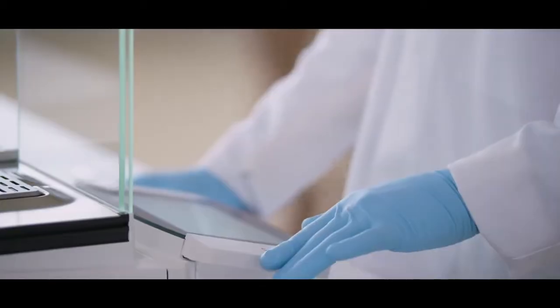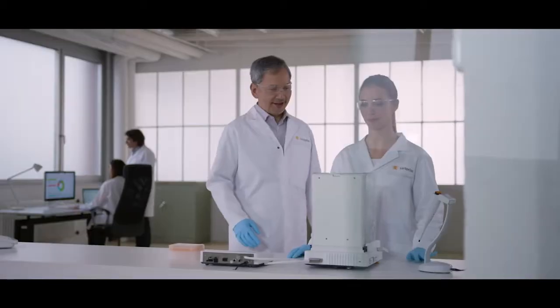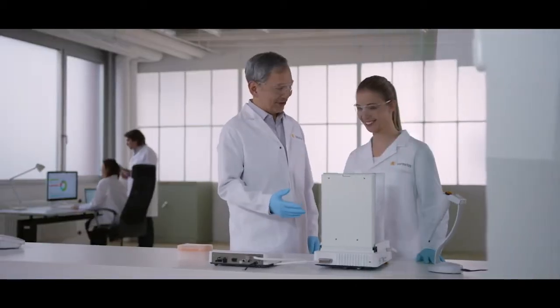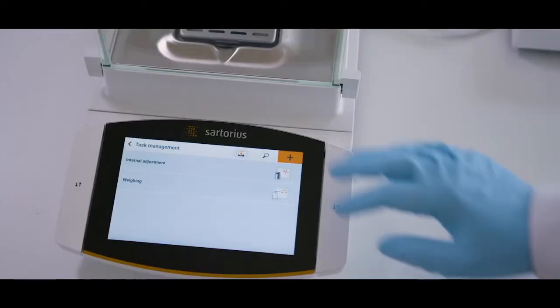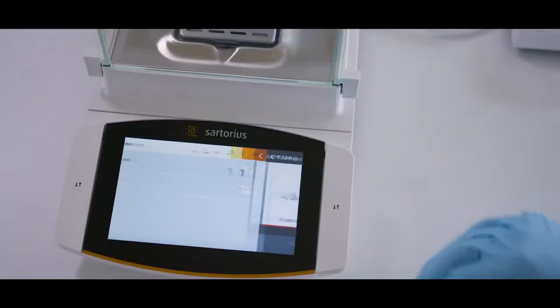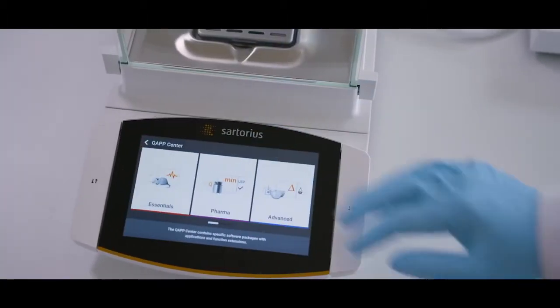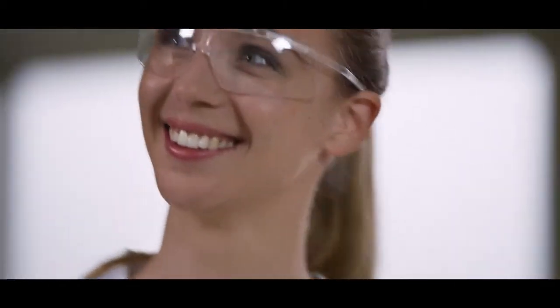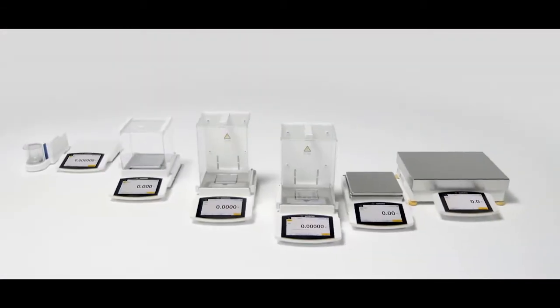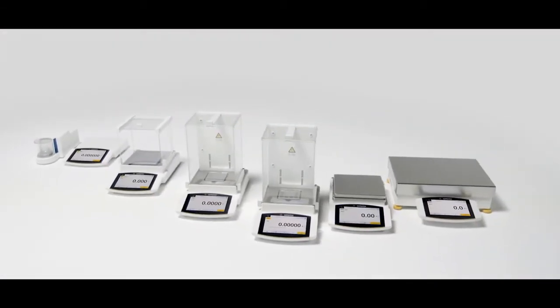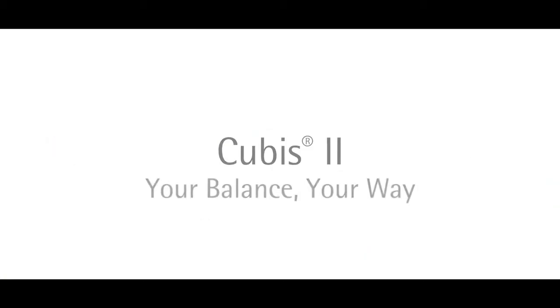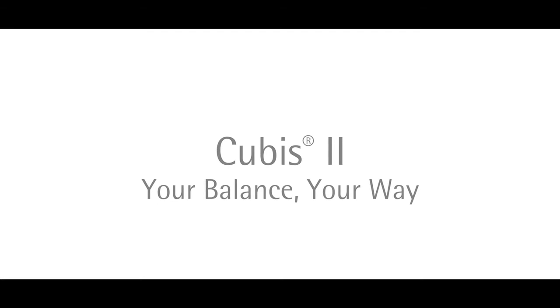The Cubis II from Sartorius is a completely configurable, high-performance portfolio of balanced hardware and software. It will align with your unique demands and compliance requirements to maximize operational efficiency and experimental outcomes.